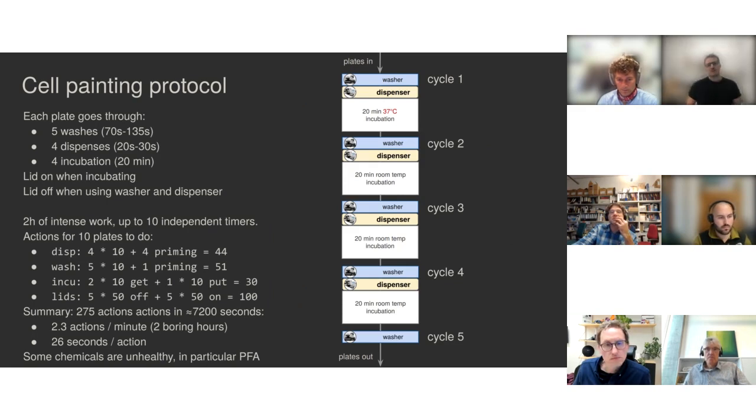And since this is like biological or biochemical processes, it's important that we have very little variance in this, so that it always incubates for like 20 minutes, and that there's no variation between the plates. Like we want all the plates to be handled identically.